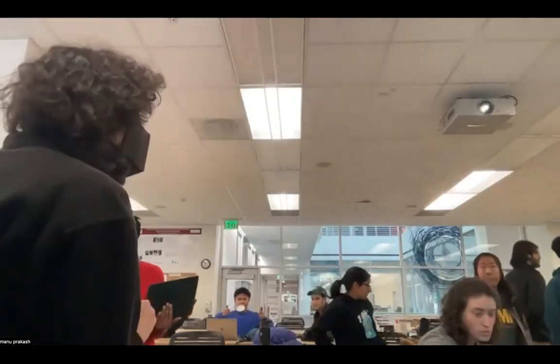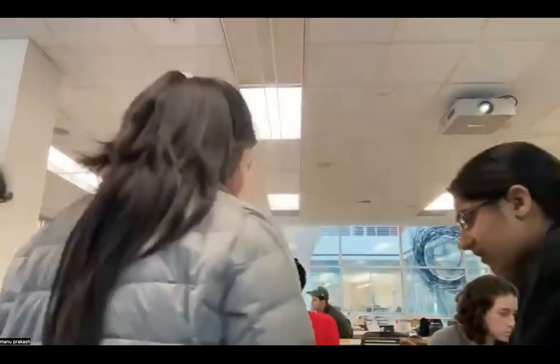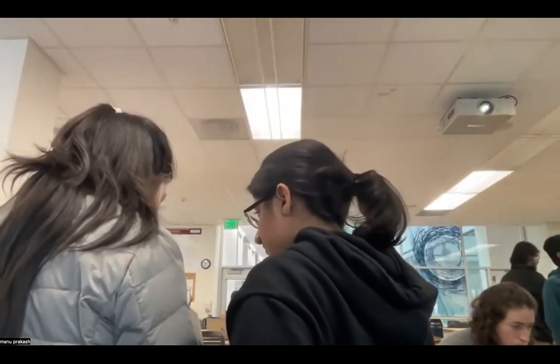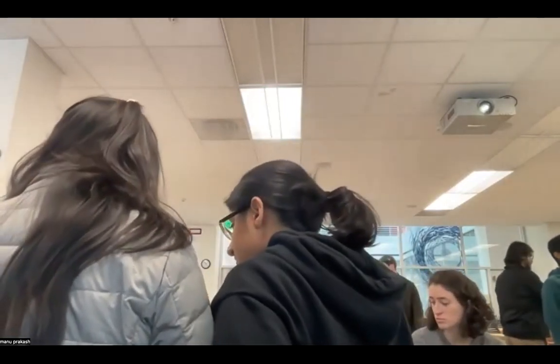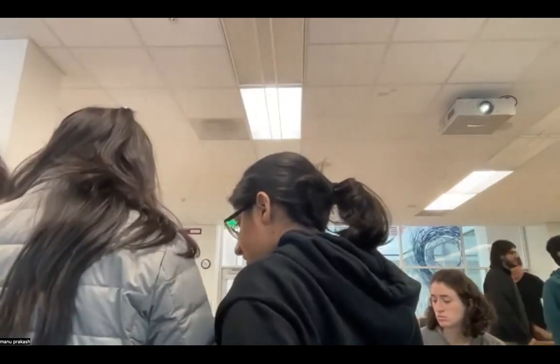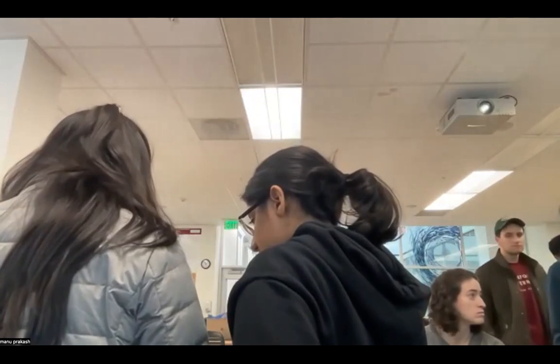Are we out of time? We still have 5 minutes. Yeah, so there are 2 more discs. You guys should make one together. You start with a piece of tape, you take one of these. And when you're using tape, try not to touch it with your hands, because otherwise it reduces. Yeah. Try not to. This one. Yeah, exactly.